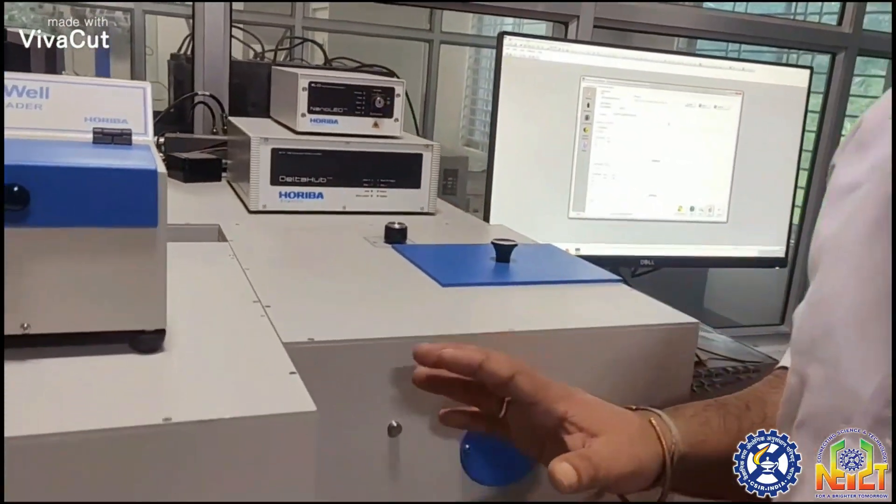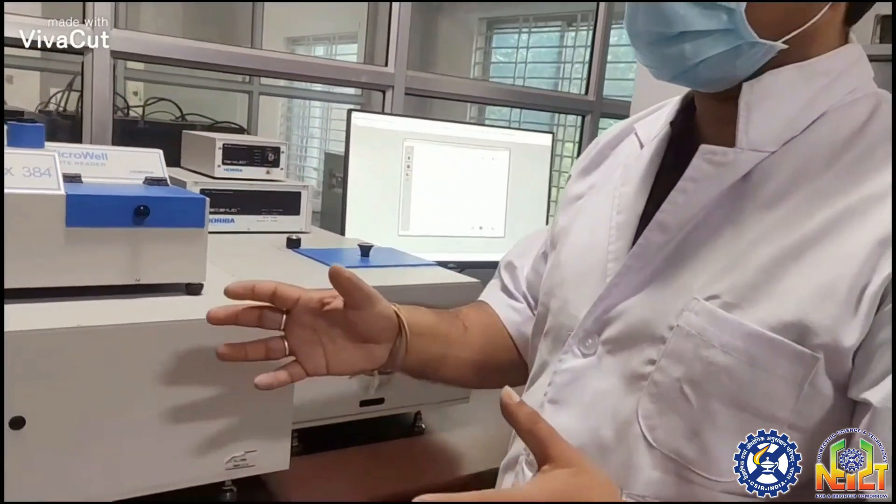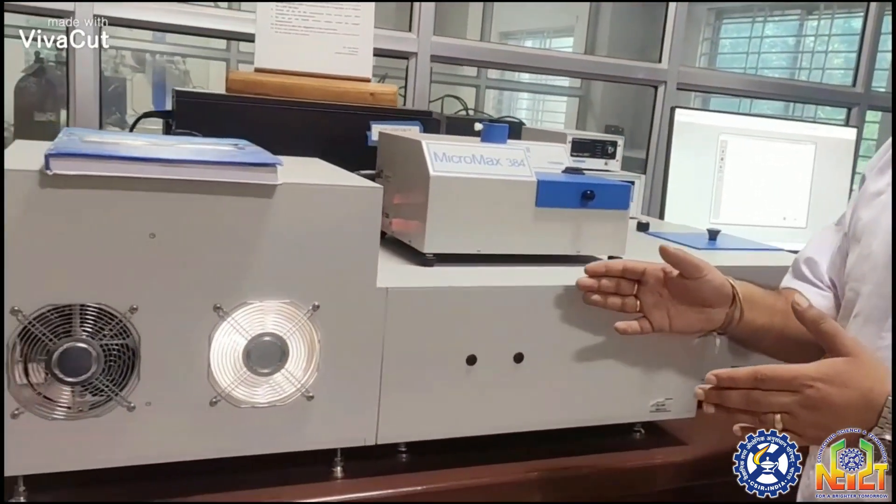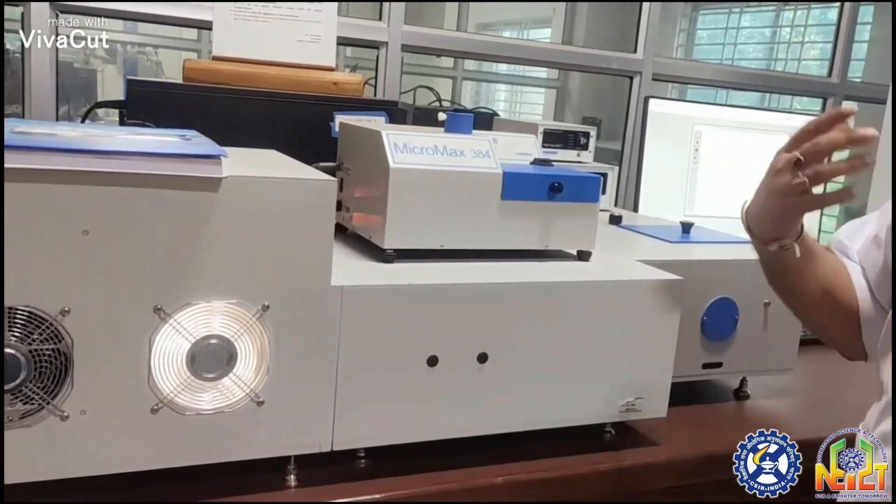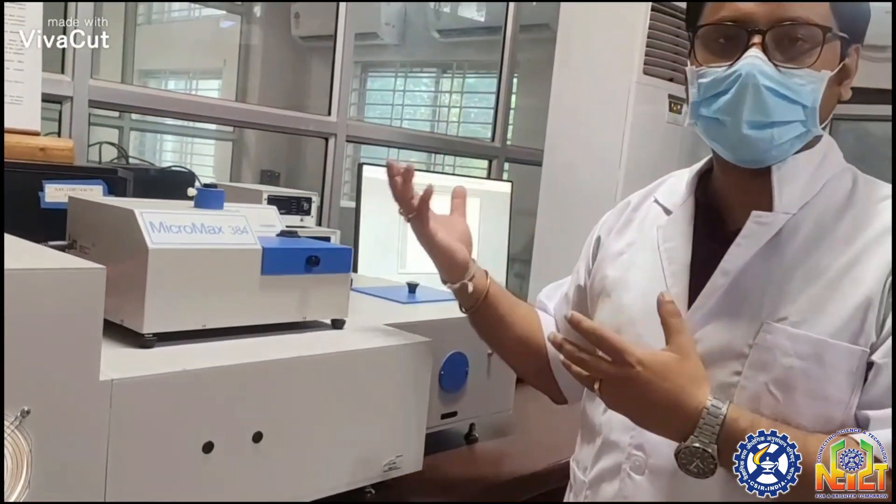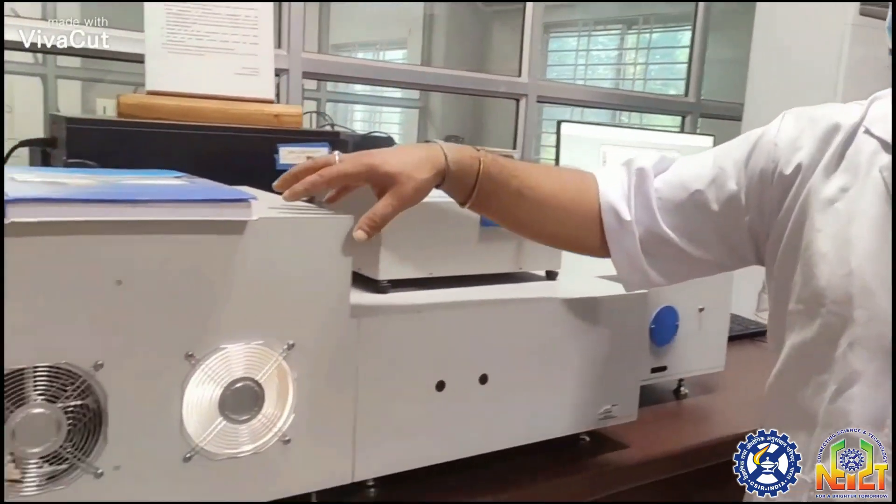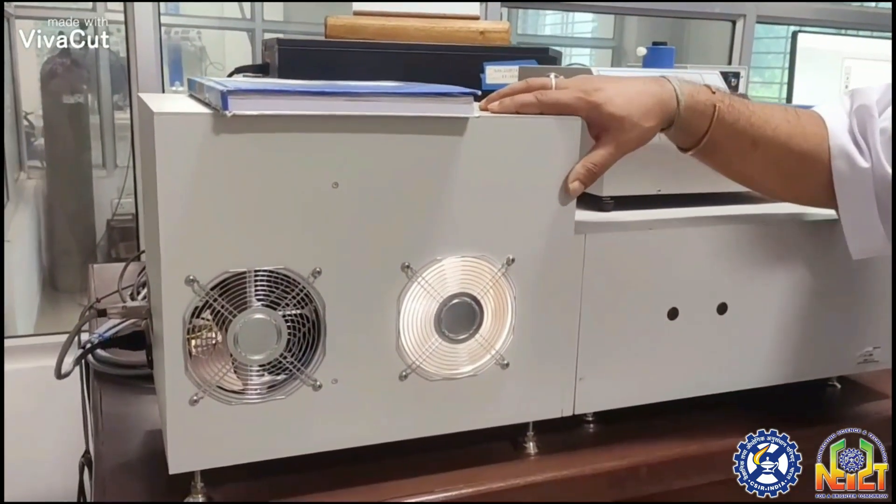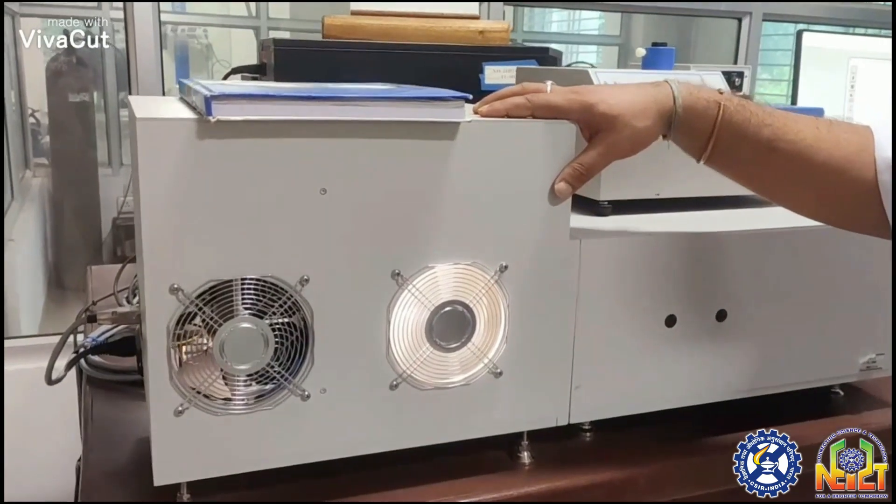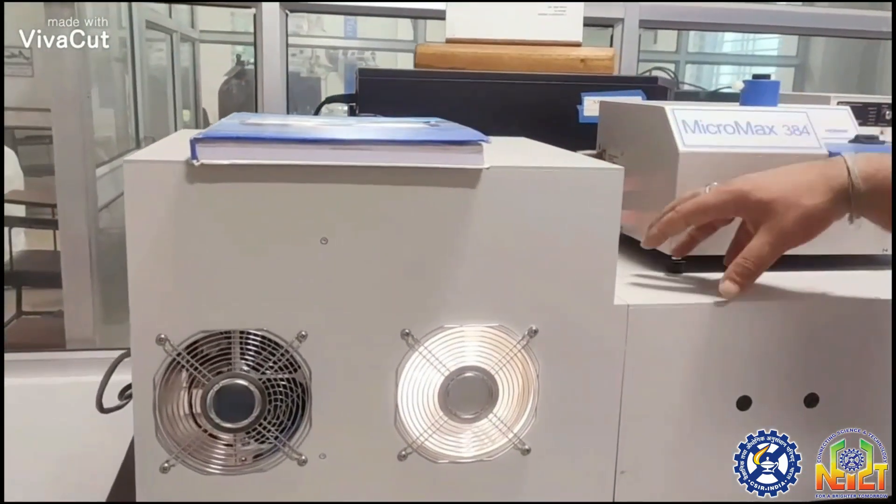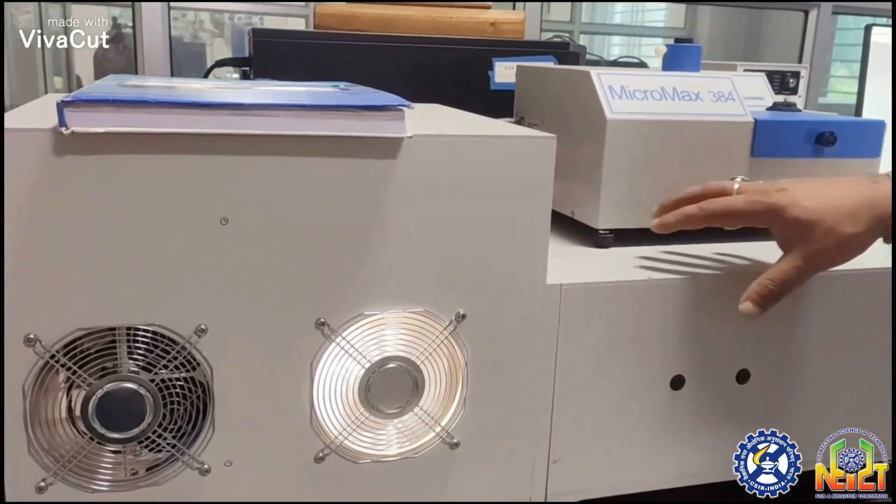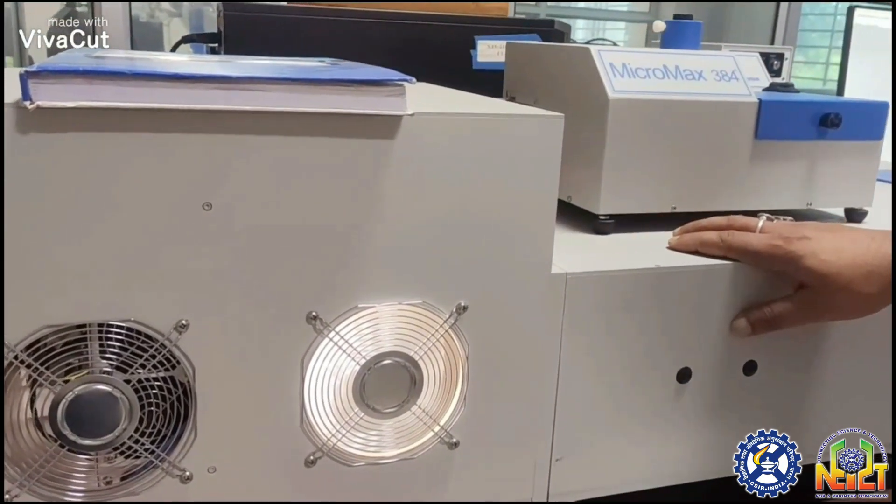In the Fluorolog3 spectrophotometer, the sample is excited by a single wavelength, then we analyze the emission at the output. The light source is a xenon lamp which is a broadband source. The broadband light is converted into monochromatic light using the excitation monochromator.